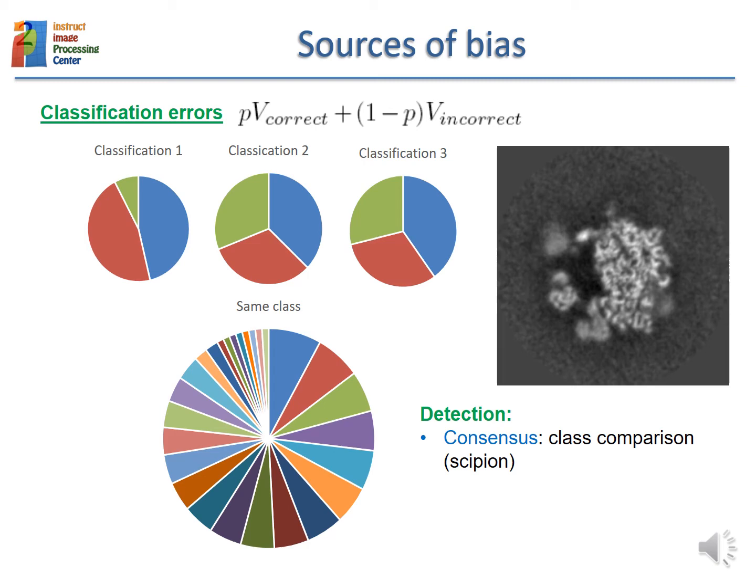If we compute which subsets have been consistently classified together, we would have this distribution. The subsets are really, really small, meaning that images were scattered over the three classes along the three runs.